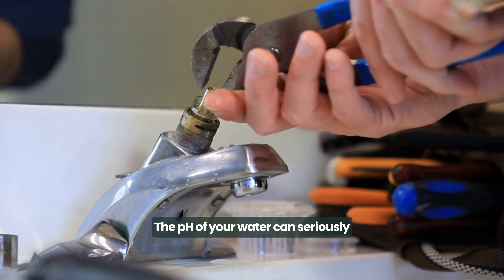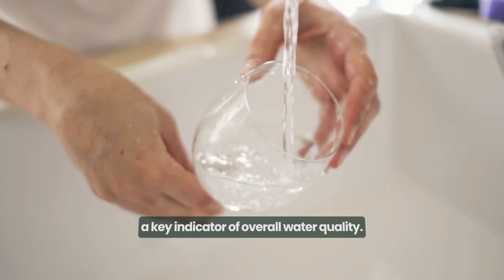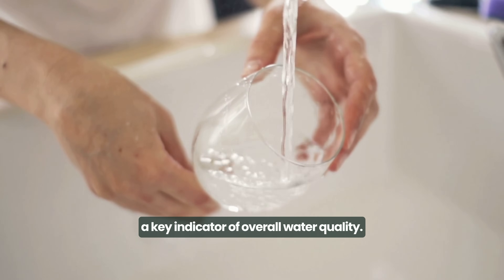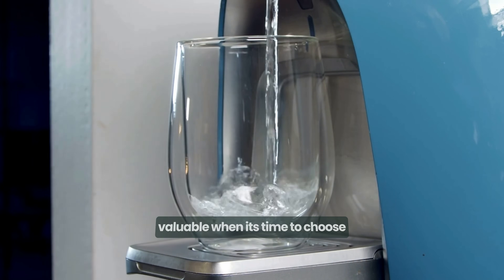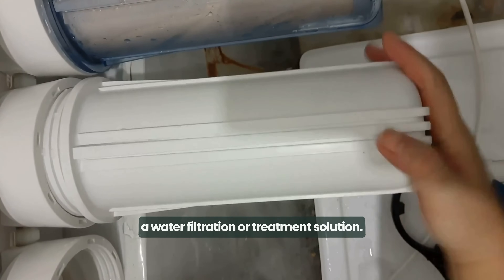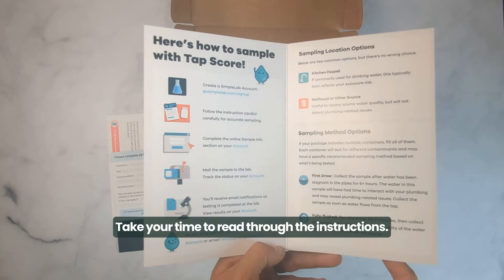The pH of your water can seriously impact your plumbing and generally serves as a key indicator of overall water quality. Knowing your water's pH is especially valuable when it's time to choose a water filtration or treatment solution. Take your time to read through the instructions.